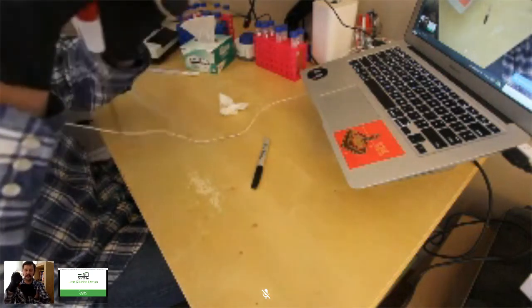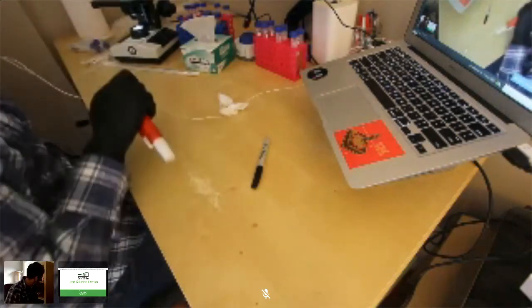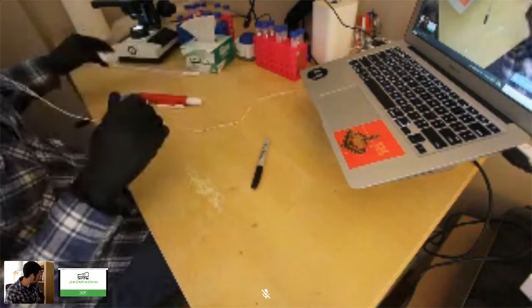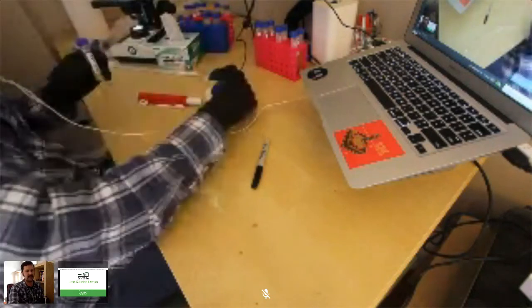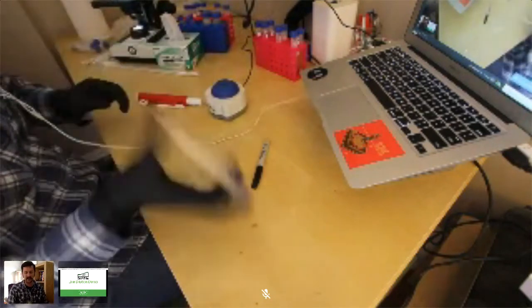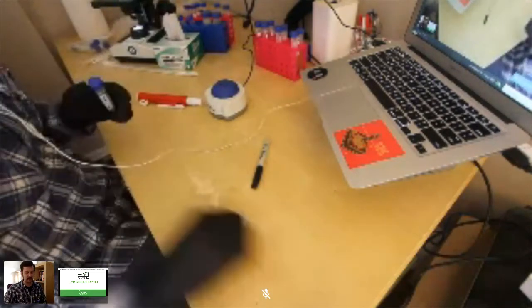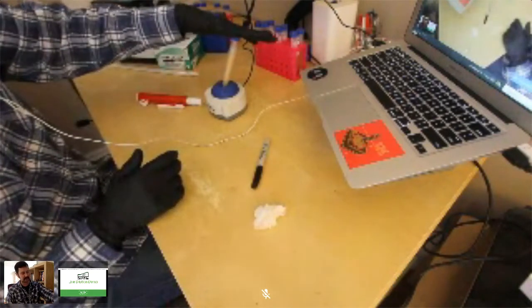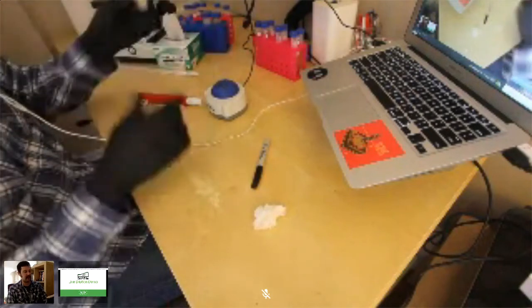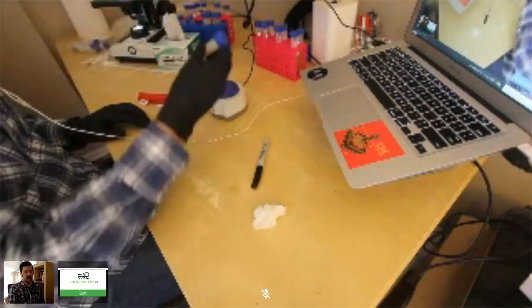And then you can dispose of that. And then you can shake it. If you're doing a lot of cell counts, I strongly suggest getting a tool such as this, which is a vortexer. We got this one from Fisher Scientific. We ran it through basically the gauntlet at Escarpment Labs, and this one is pretty much broken. We can use it for some things, but it doesn't work that great. And then you'll just vortex it to homogenize. If you aren't getting a good vortex, you can put it sideways and vortex it sideways as well. But if you don't have that, you can just shake it. Make sure you shake it really well.